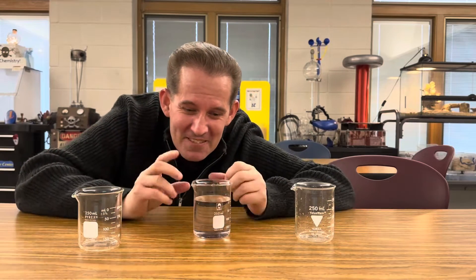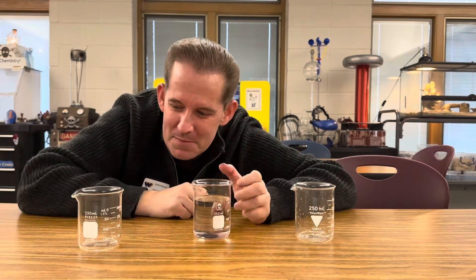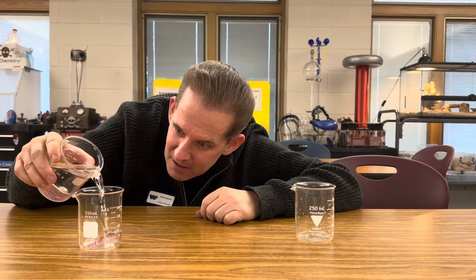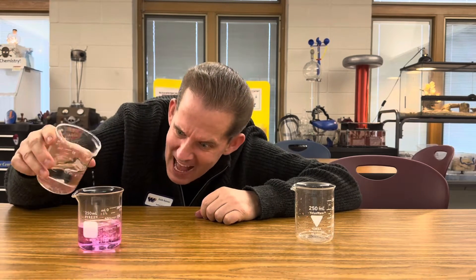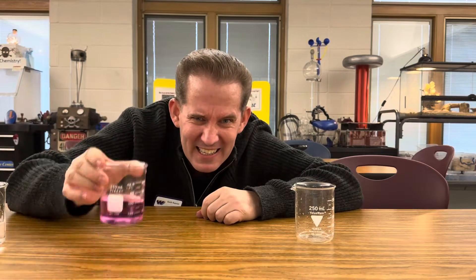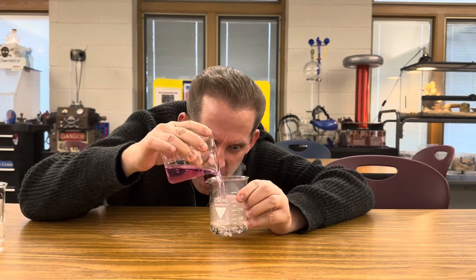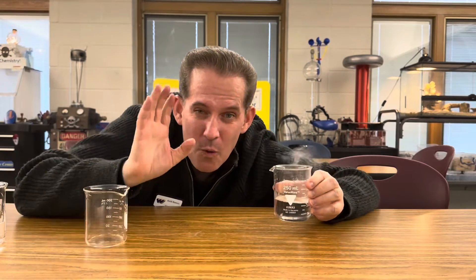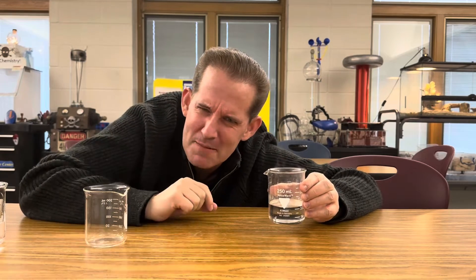Hey, welcome back to Ramseyland. Today I've got a beaker filled with water and two empty beakers. I wonder what will happen if I add some water to this beaker. Look at that! It turned pink! I wonder what would happen if I add it to this beaker. Look at that! It turned clear again! What is going on here? How's that possible?